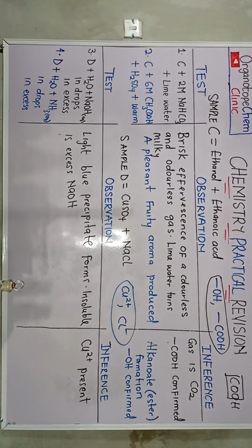Now, at the end of this qualitative analysis, you will be asked to write the equation for each reaction. So at the end, we are going to write the equation for each reaction. Copper 2 plus presence, yes.